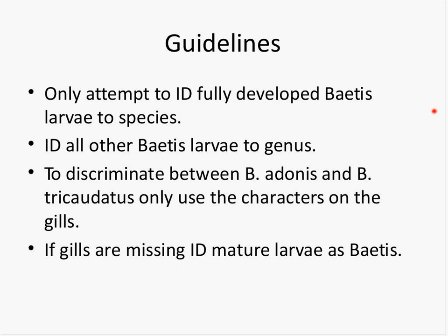Kind of what we're gonna propose is that, first of all, we would like folks to only attempt to ID fully developed Baetis larvae to species in Southern California, and ID all their other Baetis larvae just to genus.